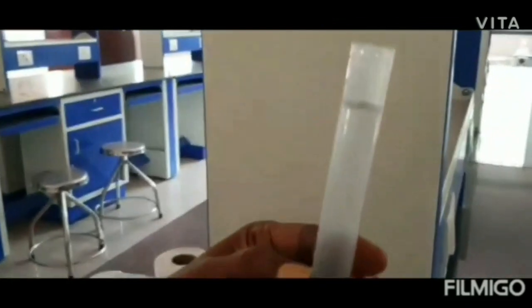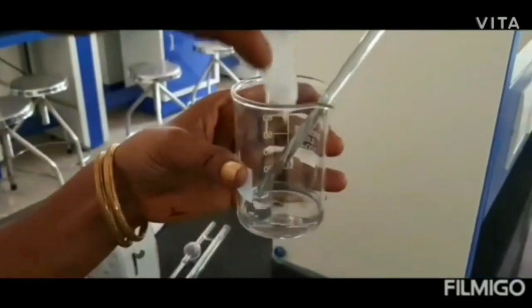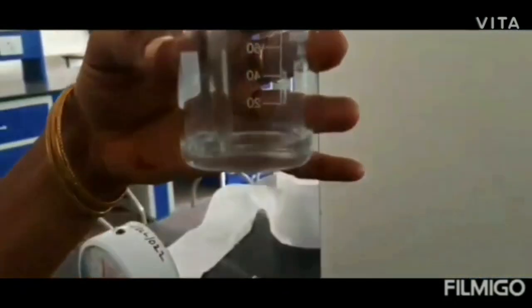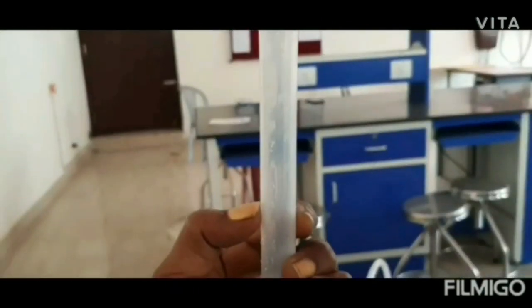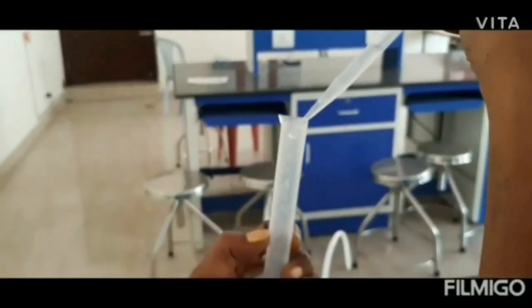Now this is transferred into a small beaker and stirred well. The PVA solution must be mixed well with the water. Now the concentration is 0.2, so it must be labeled 0.2. I am labeling it as 0.2.